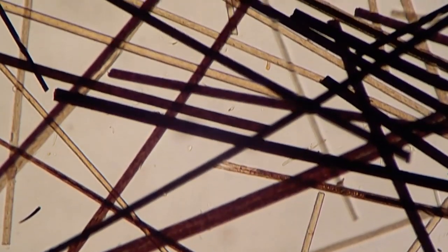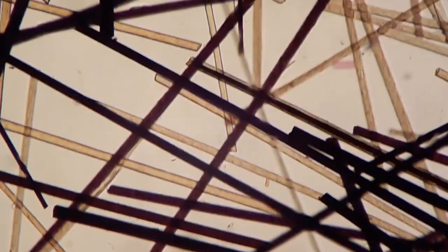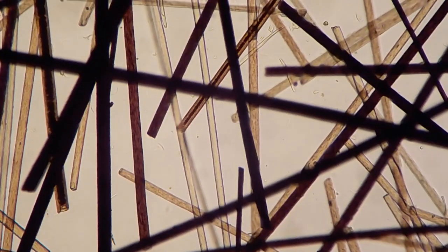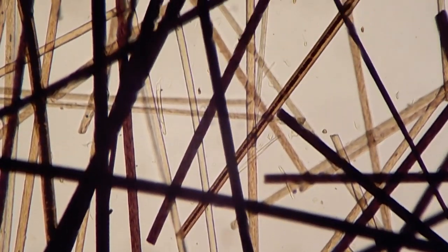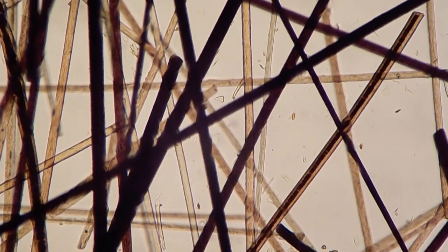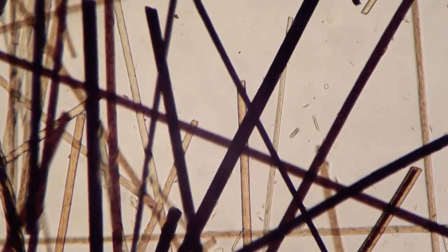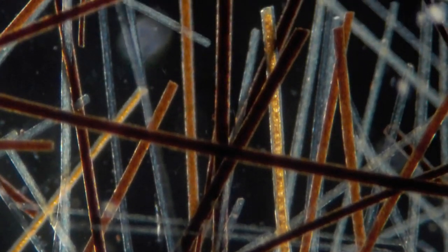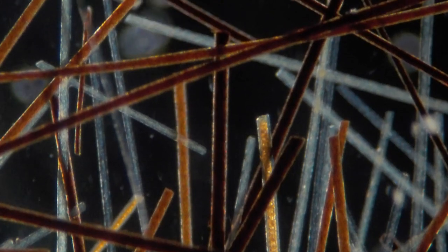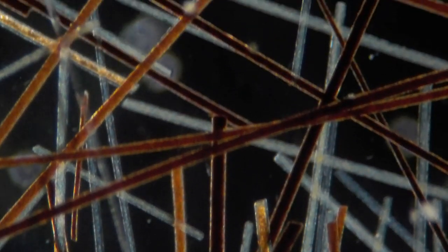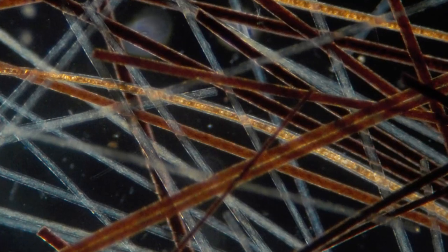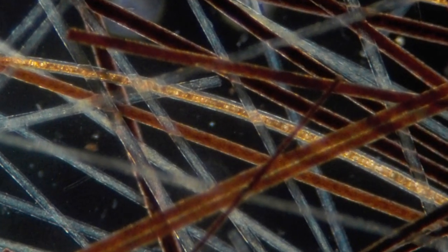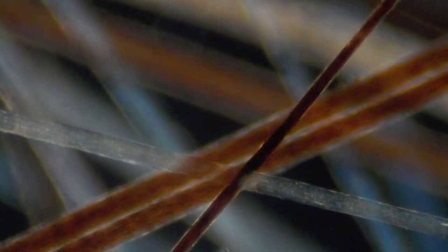And this is now under the microscope and you can see here that is basically my dog sample that I've prepared. And you can see all of those nice protein fibers going crisscross. And now I'm basically scanning the slide and this is in bright field because the protein fibers look dark on bright background. And this is dark field now because now the background is dark and I've achieved this effect by adding a filter. And this filter reverses the colors here.